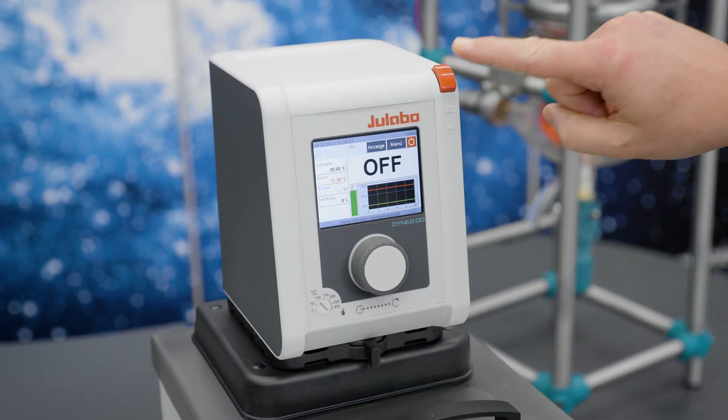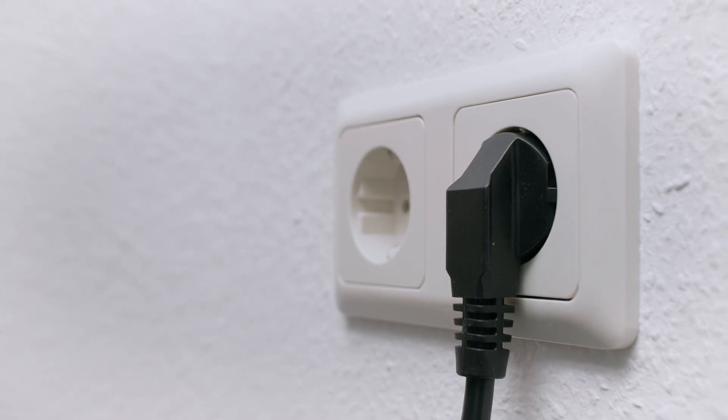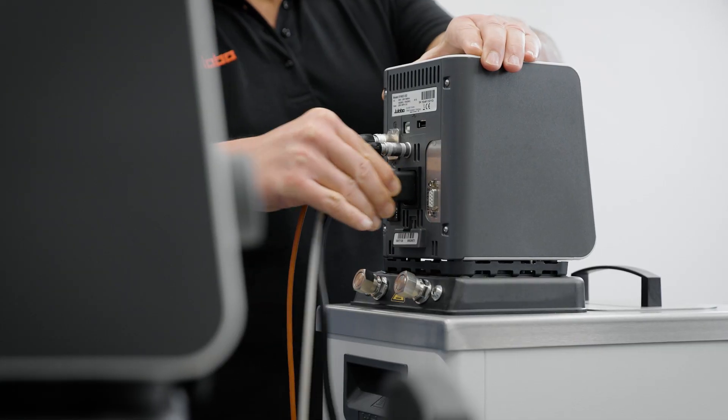Let's have a look at the Dyneu. First of all, you have to switch off the Dyneu and disconnect it from the mains voltage. You don't need to drain the bath if it's filled already.